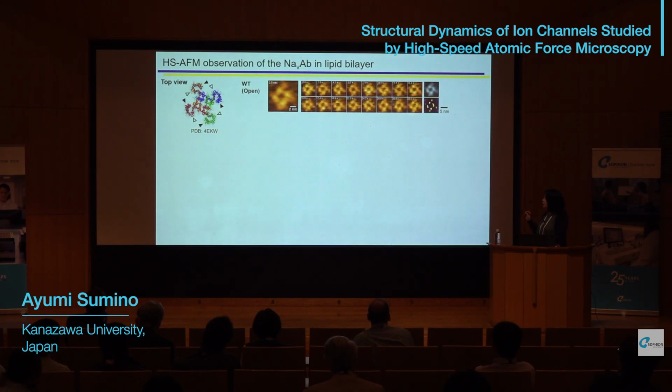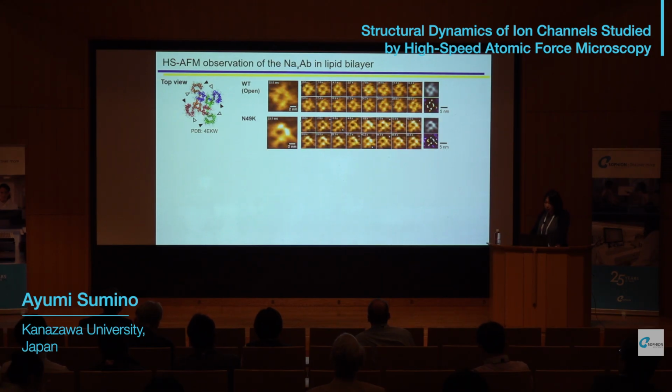Here I'm showing the result of the wild type channel. Here you can see 4 bright particles. These correspond to the 4 particles of the pore domains. And we can see smaller particles surrounding the pore module, like this. This result is very similar to the previously reported structure.